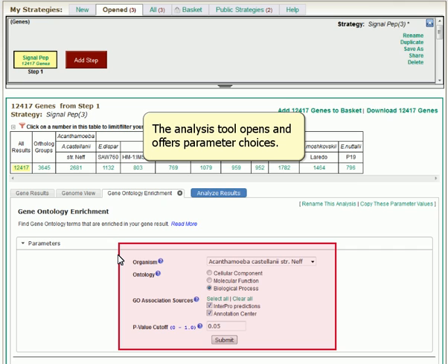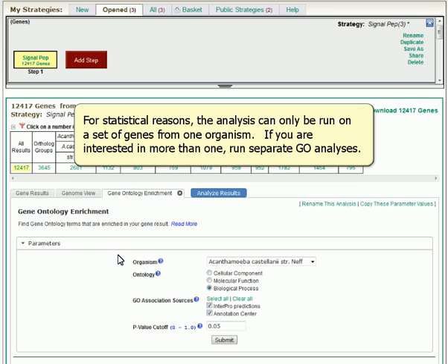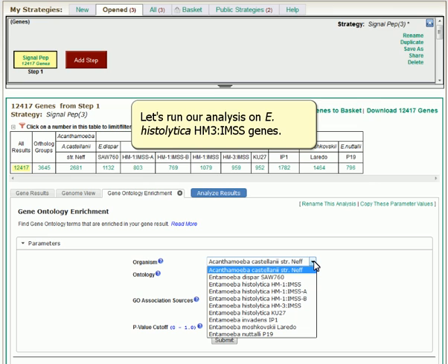The analysis tool opens and offers parameter choices. For statistical reasons, the analysis can only be run on a set of genes from one organism. If you are interested in more than one, run separate GO analyses. Let's run our analysis on E. histolytica HM3-I-MSS genes.